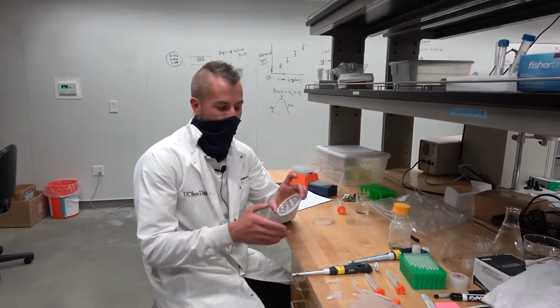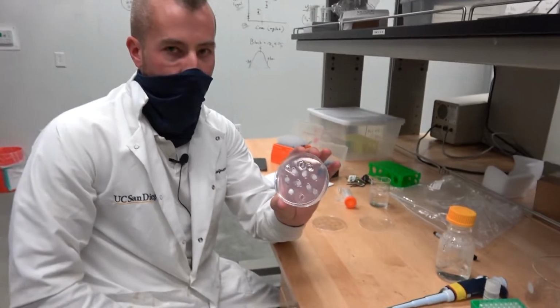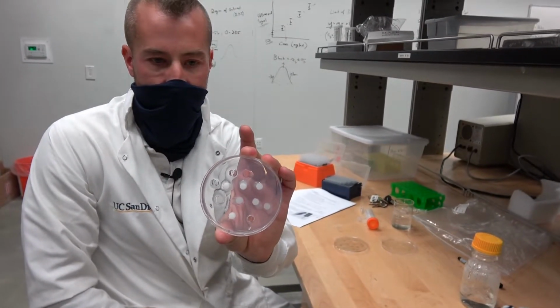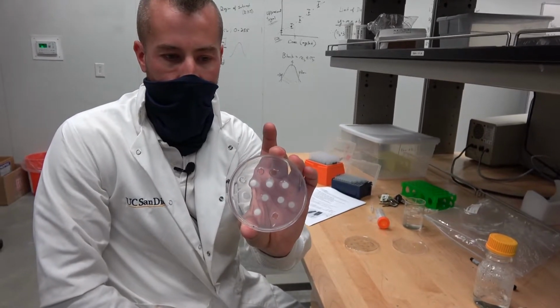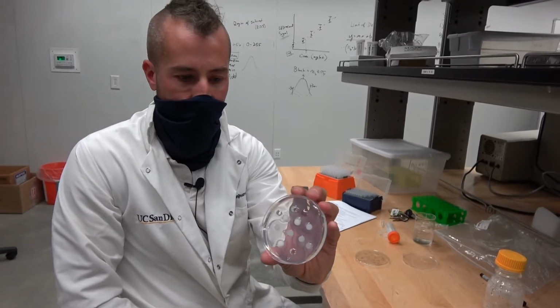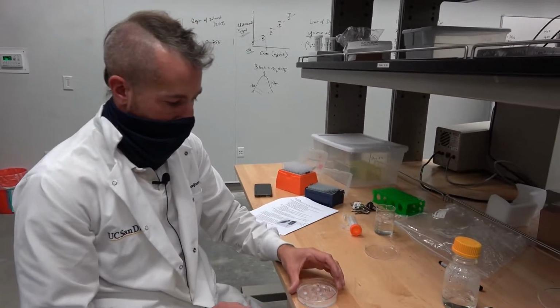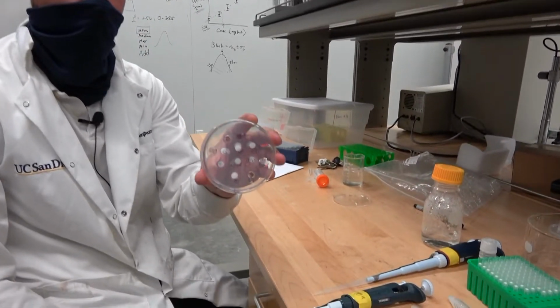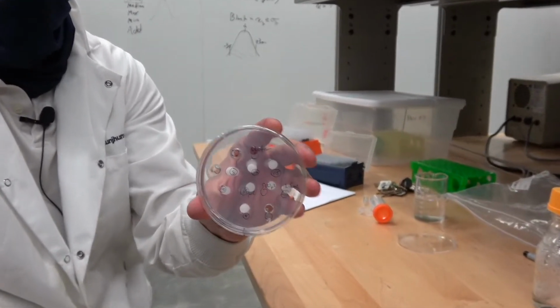Okay, so I've added all of my samples to the phantom. You can appreciate the differences in terms of the intensity of the whiteness with the different dilution factors. And I've got all my values recorded here. And so that way, when I give you the data, I'll have my labels correct.